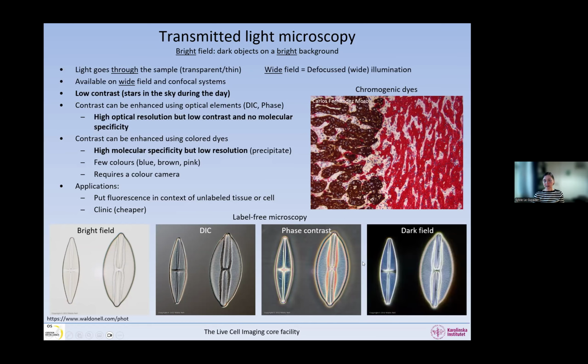An extra technique to contrast transmitted light imaging is called dark field. It's used a lot in material imaging. And so all this is some type of bright field, and this is the reason why very often bright field and transmitted light imaging are used to say the same thing. But there is an extra technique called dark field, okay? So in this course, we're going to talk about transmitted light imaging to talk about all these techniques.